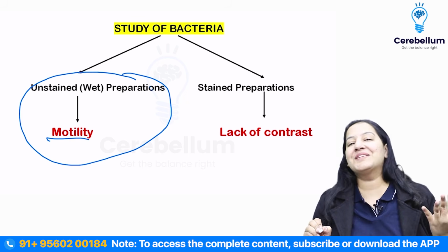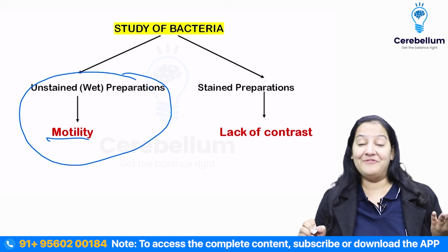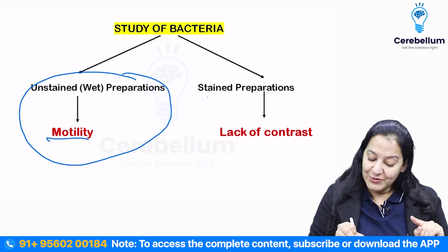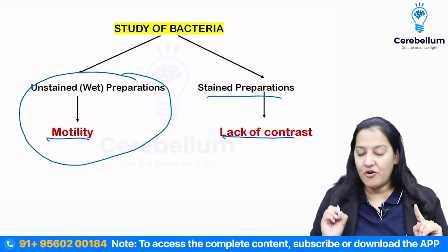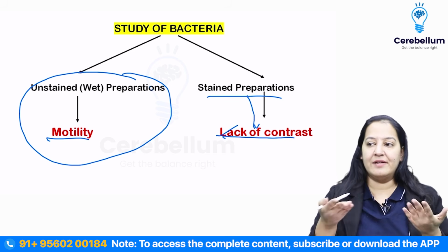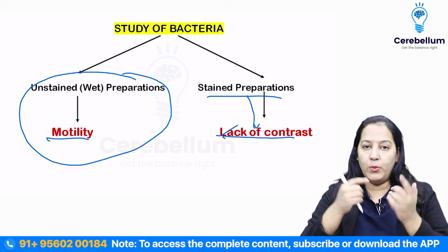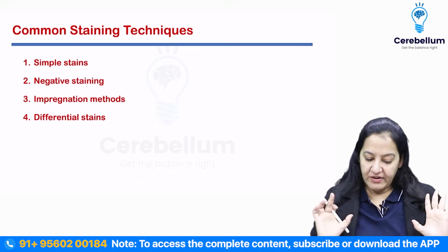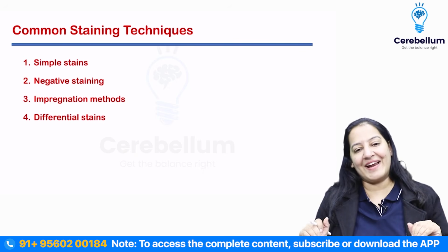But what if we want to see the morphology of the bacteria? What if we want to see the shape, size and structure of the bacteria? We have to do the staining because of lack of contrast. The reason behind staining is the lack of contrast. I told you bacteria is transparent, the slide is also transparent. We cannot see transparent on a transparent background. We have to provide the contrast. We have to. So what are the different types of techniques available?